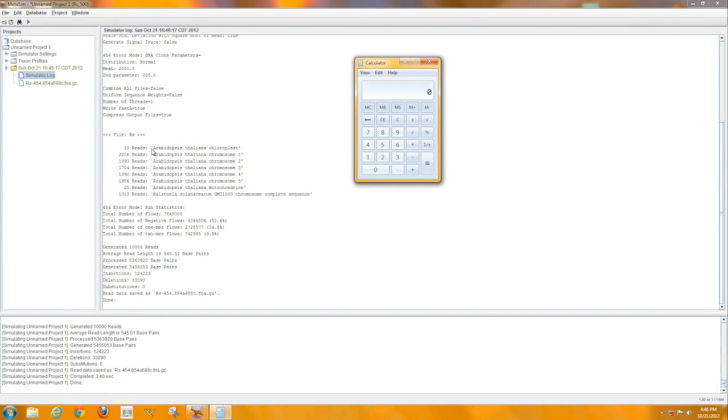If you're curious what your total pathogen reads are in this 454 run, we know we had 10,000 to start with, so you can plug in the number, 1,313, divide that by 10,000, and multiply by 100. That gives you the percentage of actual pathogen reads in this 454 mock sample database.